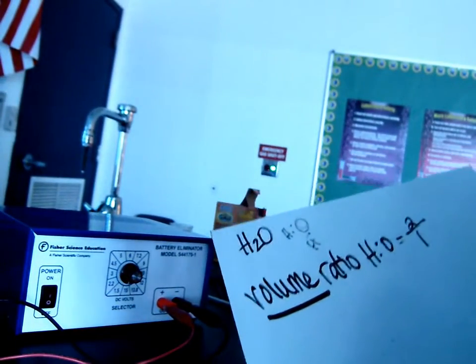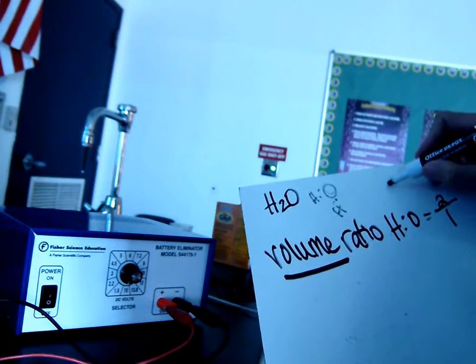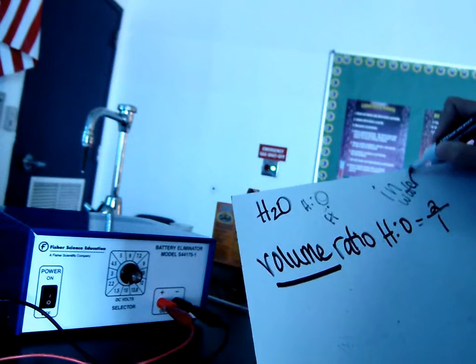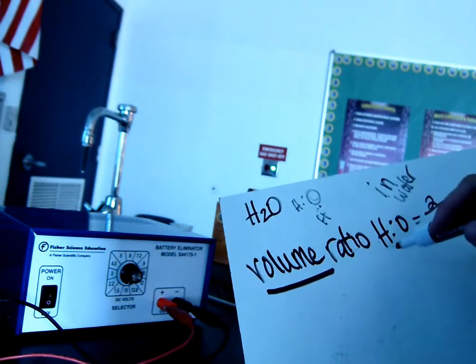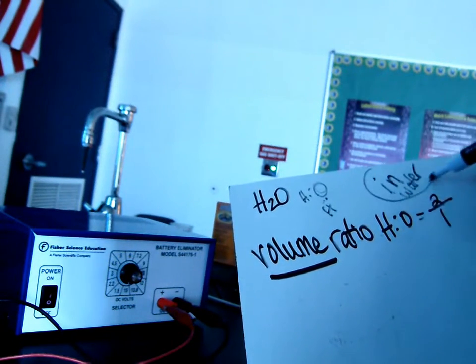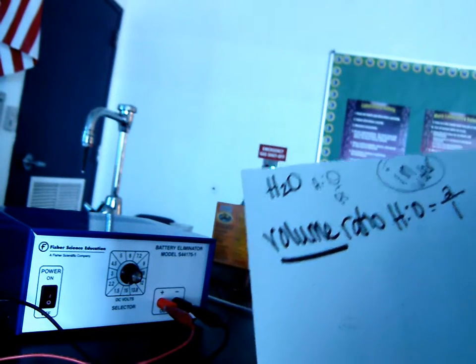And again, let's also clarify the volume ratio of hydrogen to oxygen in water. Because there's many compounds that exist that contain hydrogen and oxygen. So when we talk about a ratio of hydrogen to oxygen, we always need to clarify what we're talking about, the hydrogen and the oxygen that we get when we decompose water.